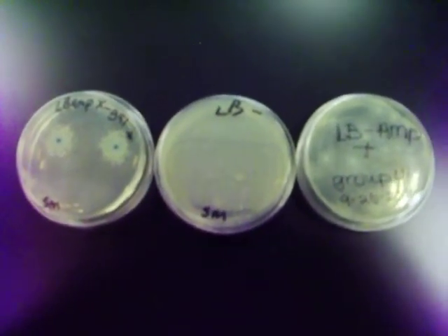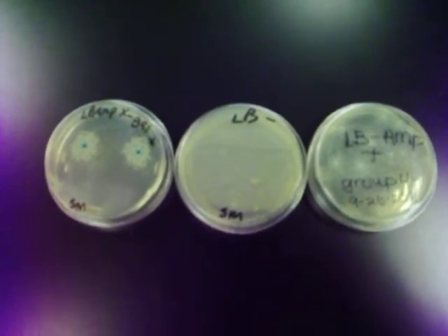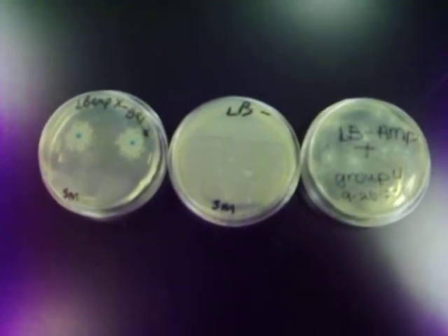These are the results from our transformation experiment. The procedure used Escherichia coli, which is commonly called E. coli, which is not competent.